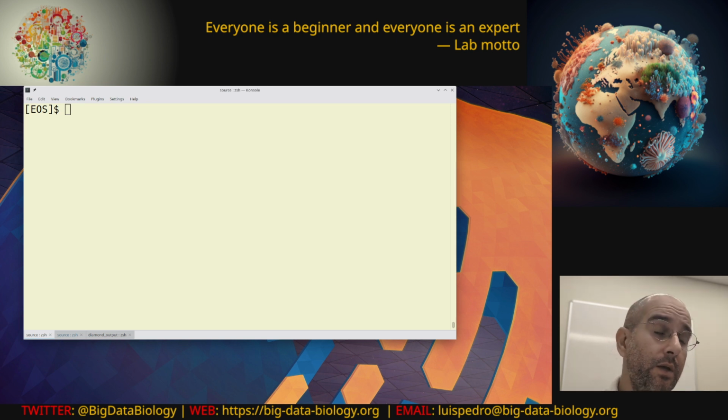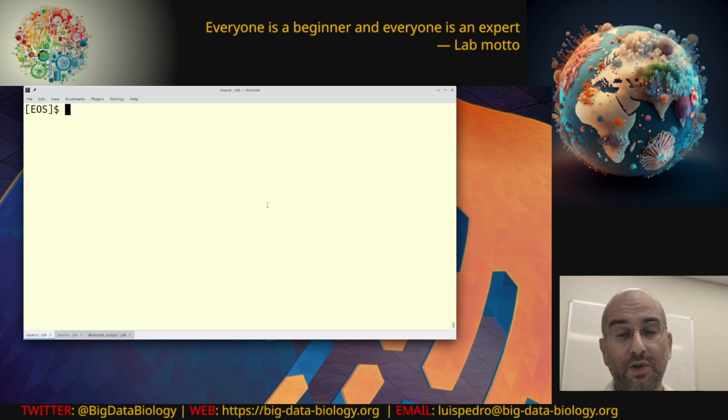I am going to, as usual, start with a recap of the recap. To recap, we are trying to understand how small mutations impact estimates of quality, and then potentially to use the fact that small mutations are going to introduce apparent pseudogenes, which means things that are pseudogenes in the sequence, but were not really pseudogenes in the original bacterium.